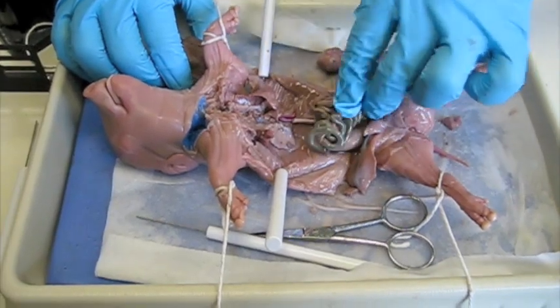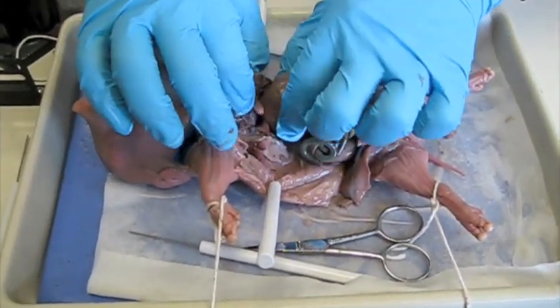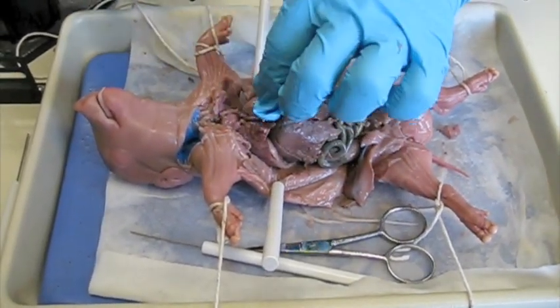This is the end of our dissection. Put the organs you removed back into their position inside the pig, remove the probes and string, wrap the pig inside the paper towel, and wait for further instructions from your teacher.